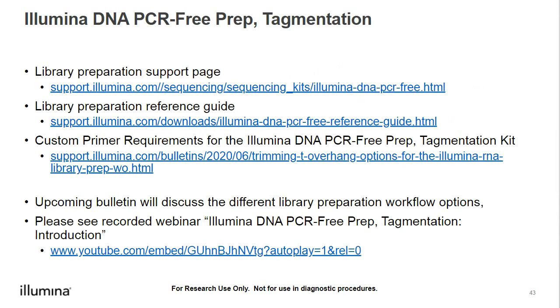Here, I've linked to the support page, the reference guide, and a bulletin which gives more information on when and how to use custom sequencing primers for the Illumina DNA PCR-free libraries. We do have an upcoming bulletin which discusses the different library preparation workflow options that you can choose depending on your input. And then we have a fantastic dedicated webinar which is available at the final link here, and you can watch it at any time.